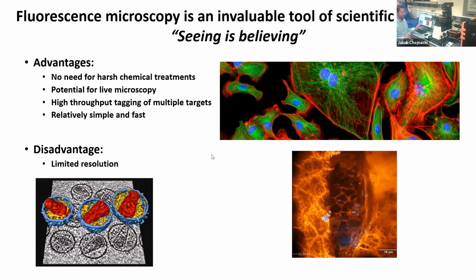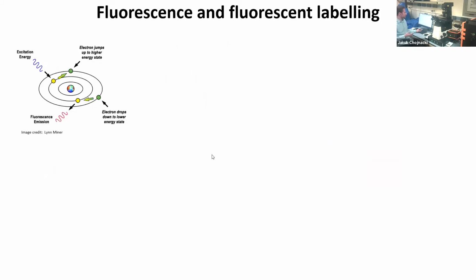But before we get to tell you about super resolution and fluorescence microscopy, I want to also give you a little bit of background on what exactly fluorescence is, and what fluorescent labeling is, since these are very important central aspects of understanding fluorescence microscopy.